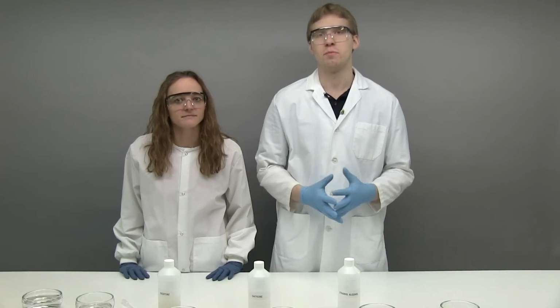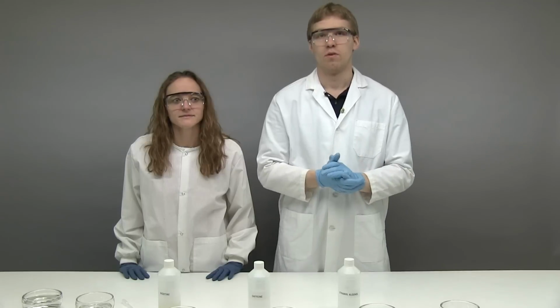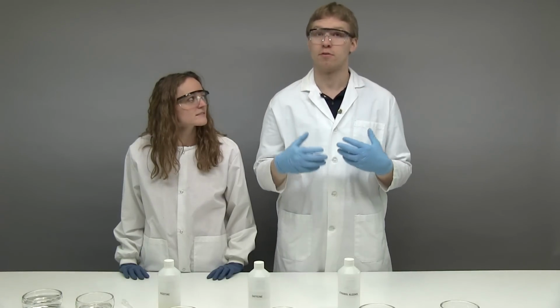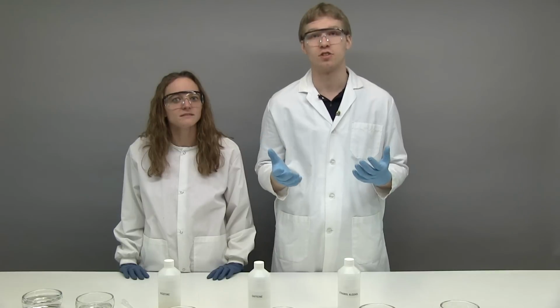Every observation is going to be different depending on the size and the health of the worms used. Within 15 minutes of returning the blackworms to their habitat, you should start to see a recovery. And you can see a full recovery within 24 hours, even with higher concentration.